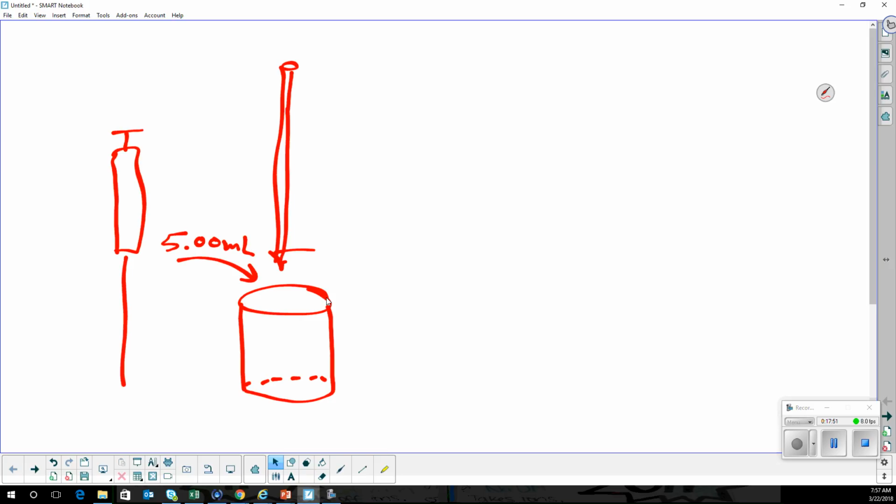But make sure you label what you did. I did buffer A with the acid. I did buffer B with the acid. I did buffer A with a base. I did buffer B with a base. So that when everybody gets all their graphs and they're trying to interpret them for doing all the rest of the stuff for this lab, they can do that. I'm not bringing this lab notebook in until after I come back, so you'll have time to work on all of that. But it'll be coming in right after I come back, and you'll have 3 labs in it.